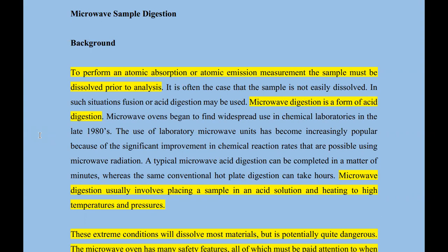Wet ashing, it is because a solvent is present during the exposing of these solid samples to high temperature in the presence of the acid. So what is the microwave acid digestion?